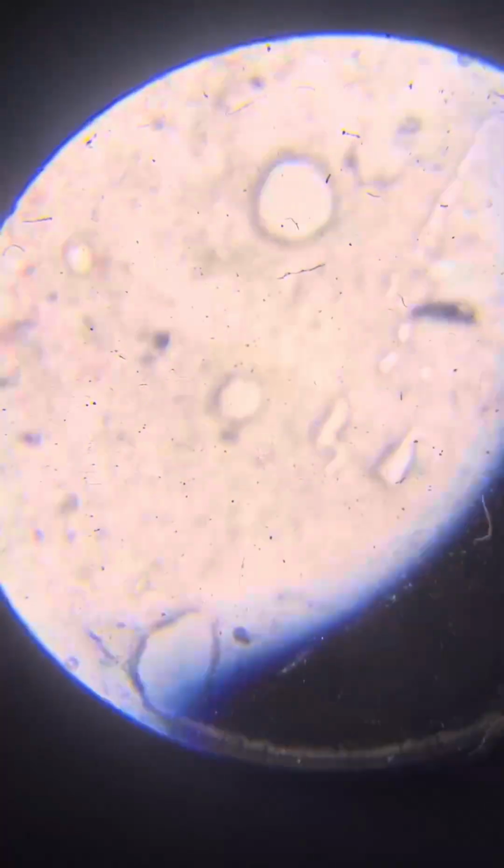This is from the big one that is almost up to the top, and it's always mixed, so it's pretty much statistically given that everything is like that. But because this is the larger one with the most material, I've taken another sample from that, so we'll actually watch another sample of that. But before we do it, maybe we'll just zoom in a little bit.